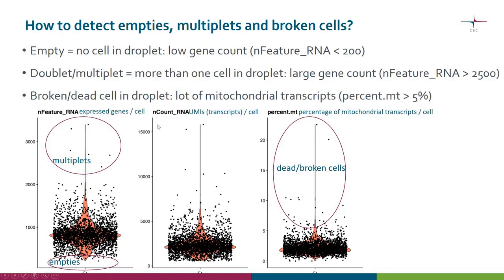On the other hand, it can happen that several cells end up in one droplet — perhaps two cells, giving a doublet, or even more giving a multiplet. This is also a problem because we only want one cell. The way to detect this is to look at the number of genes expressed; the default threshold is 2500. You can see that some cells are really high up in the plot — these are the potential multiplets.